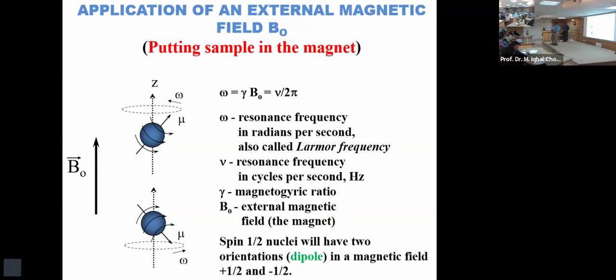Okay. What was your other question? We have this compound and this compound, and we have a magnetic field. And this compound also shields. Not only can the electron shield the protons, there is also another form around the target compound that can shield the magnetic field. I would like to have two compounds together when you measure. It can be an experiment, you know.